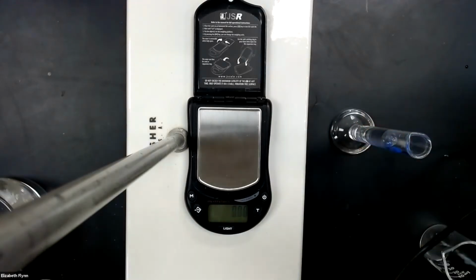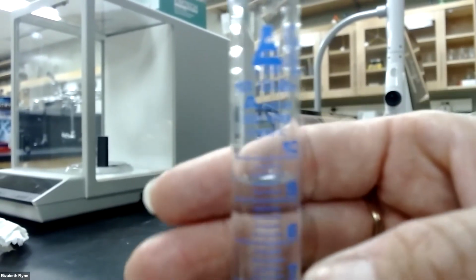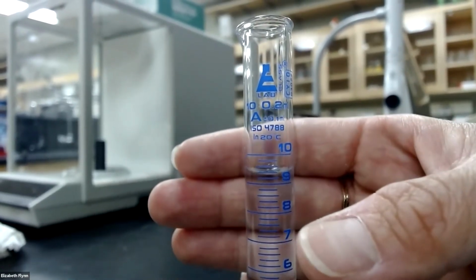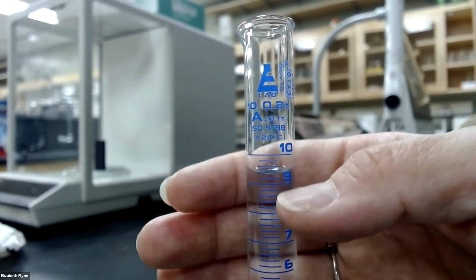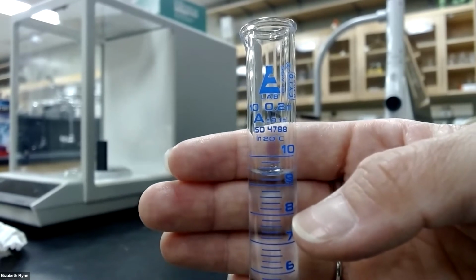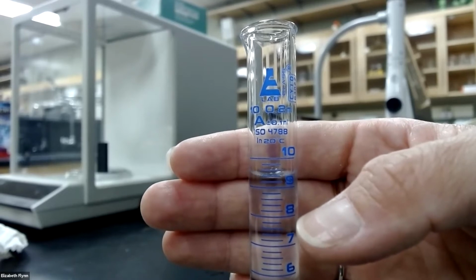So I'm going to bring this down. Let's read this volume here. Remember what we learned before, we want to make sure that we read the bottom of the meniscus at eye level. So we know we have at least 9 milliliters. We know we have at least 9.2. It's below the 9.4 and above the 9.2.